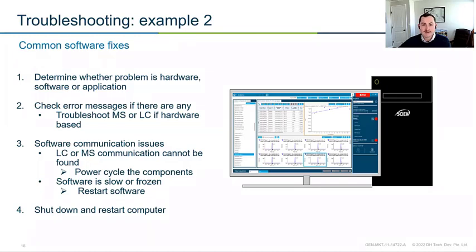And if you don't have access to the services, just go ahead and restart your computer. And while you're doing that, go through and turn the power switch off on your pumps, your autosampler, column oven, the entire LC stack, and leave it off. Typically, when I turn off a power switch for a mass spec or an LC, I like to wait 10 Mississippis before switching it back on again.